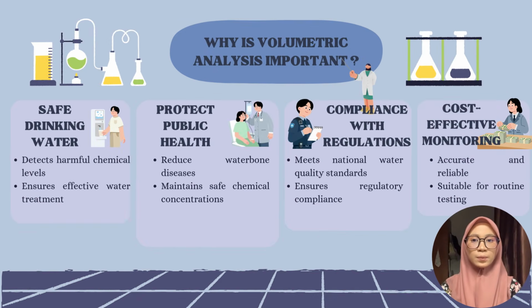Volumetric analysis is important for several reasons. Firstly, it helps provide safe drinking water by detecting harmful chemical levels and ensuring proper water treatment. Secondly, it protects public health by reducing the risk of waterborne disease and maintaining safe chemical concentration in water.